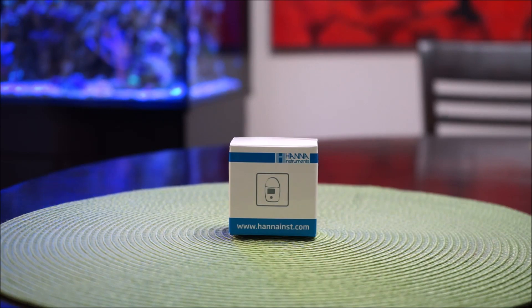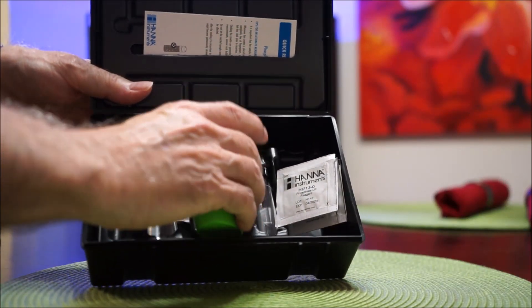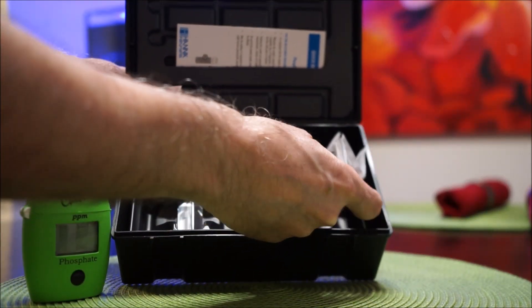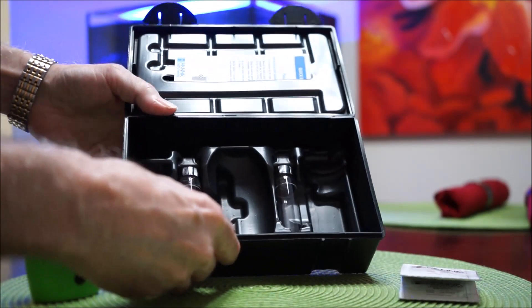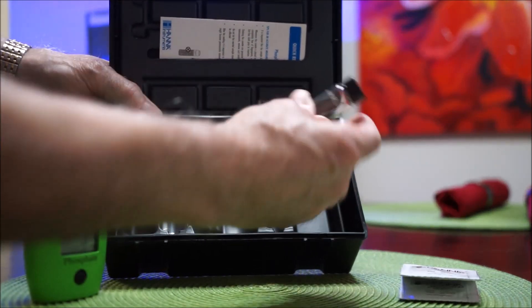Before we start, I want to show you the refills. They come in these little boxes for 25 tests and run about $8 to $9 per box, depending where you get them. You have the Hanna Checker in the middle, and it comes with seven test powders to check whatever it's for - in this case, phosphates. And then when it comes to these vials, these tubes, there's two of them, one on each side.